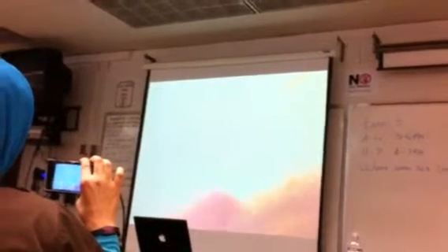Let's try a lymph node. I'm almost afraid. Let's see what we have. It looks a little better.